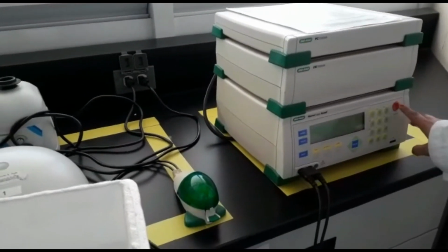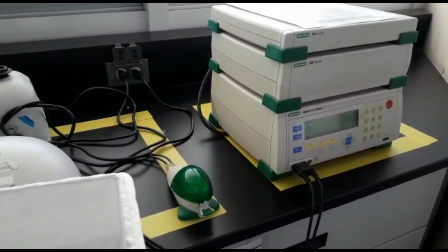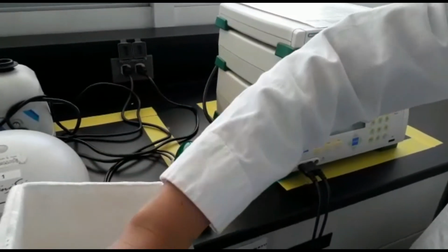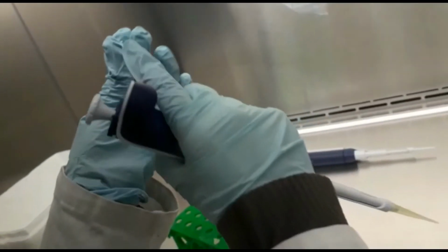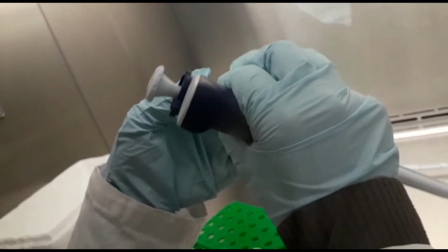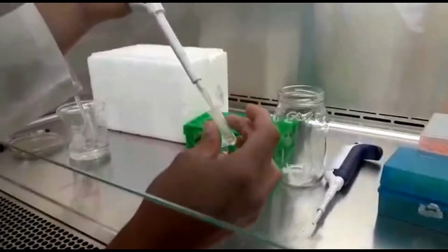And then we have to incubate them at room temperature for 10 minutes. We have to remember that to prepare the ligation, we can use the quantities of the reagents shown in the table below. After transforming, we have to add 300 microliters of SOC. We have to spatulate the entire volume on an LB plate with ampicillin, and after that we have to incubate again with the plate at 37 degrees overnight.